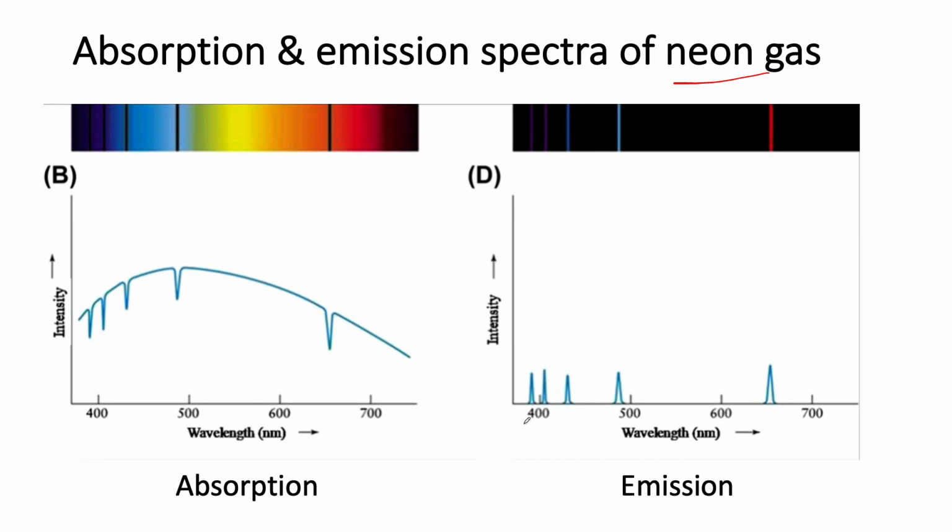And this has some advantages. It can be more sensitive because you don't have this background. You're just looking, because in between these, there's nothing, right? There's no emission coming at any other wavelength other than where these atomic transitions occur, right?